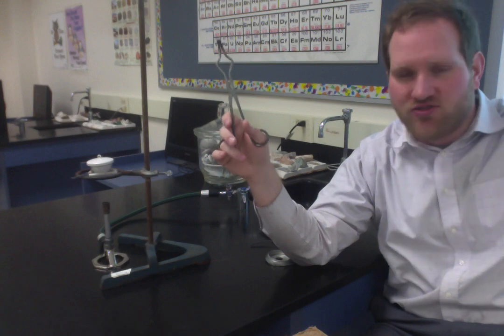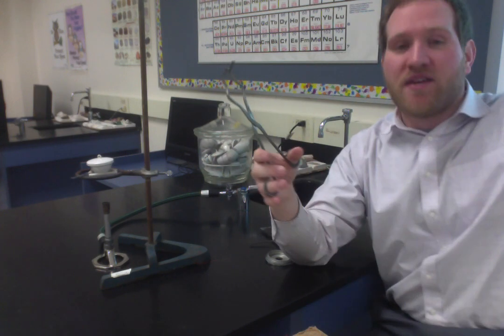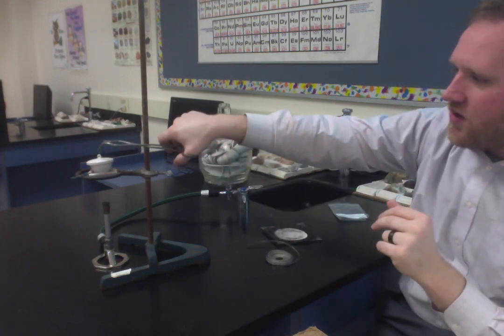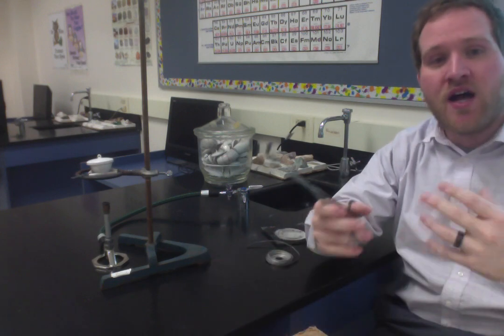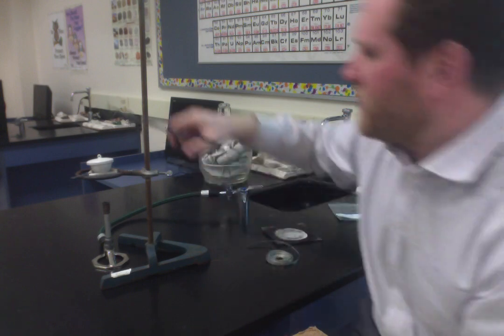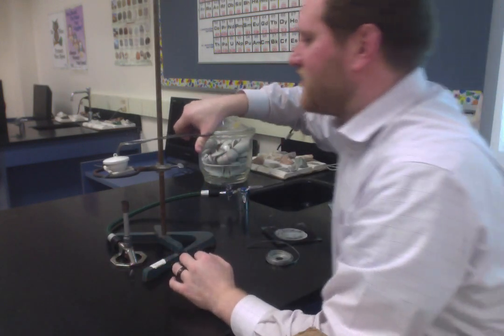They're going into the ventilation system, but that's your lab data escaping through the vents. So again, what we want is a controlled opening of the crucible to allow a little bit of oxygen in, but not enough to make it flare up and light up. So the technique we'll use is like opening it and peeking inside, okay?